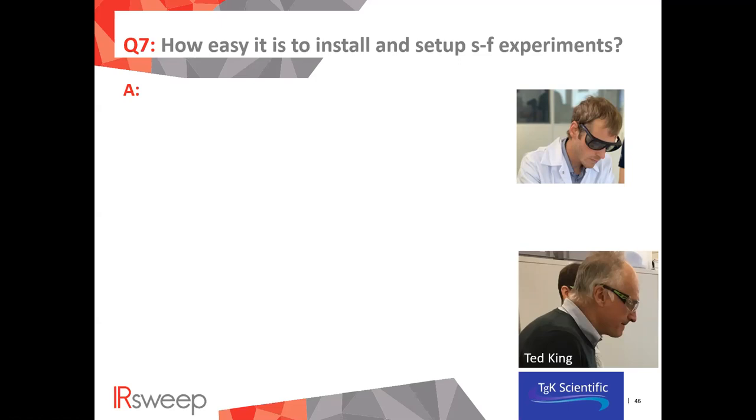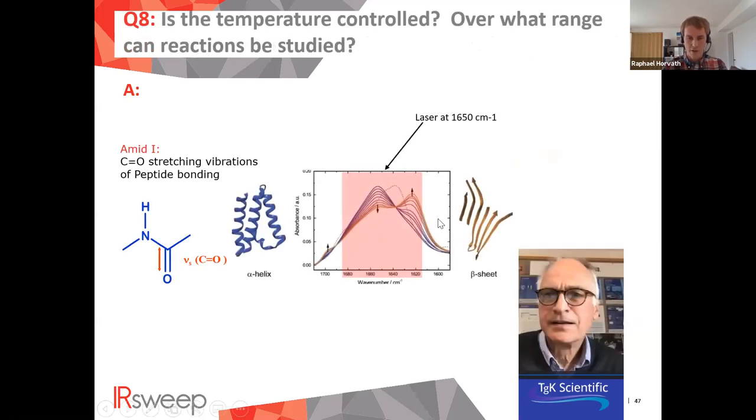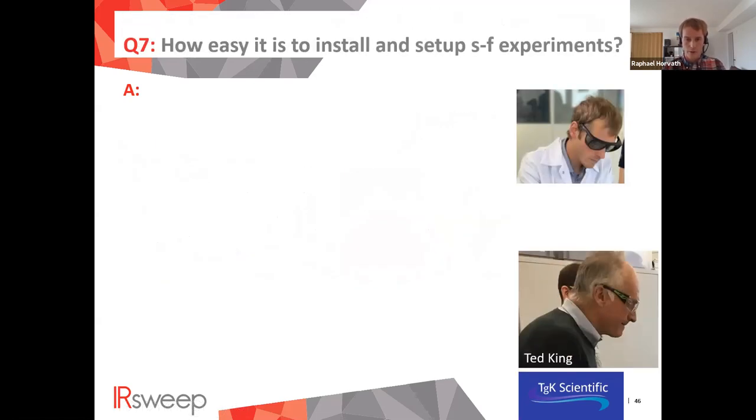Another question for you probably, Raphael: has anyone tried to inject colloids of 10 to 100 nanometers instead of solutions in these systems? Has anyone? I'm not sure. I've not done it myself, at least not deliberately. In the MCA work that I mentioned, we used saturated solutions, and there was probably some MCA. It was more of a suspension of MCA. I don't see why it wouldn't work, to be honest, but I haven't tried it myself. Maybe Ted has.